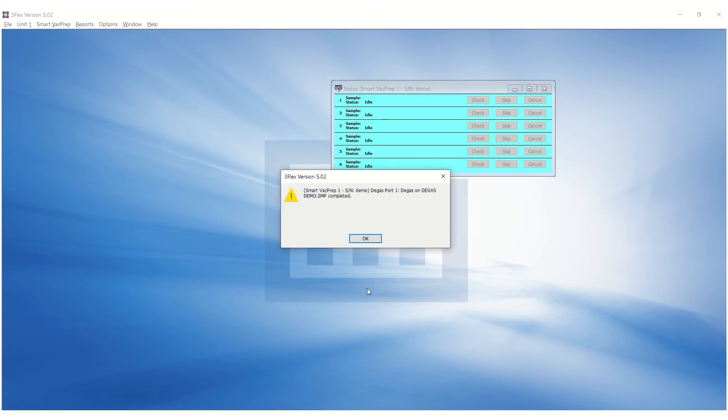Once completed, a notification will be shown with the SMP file name indicating that degas is finished. The sample can be removed from the SmartVacPrep and mounted on your instrument for analysis.